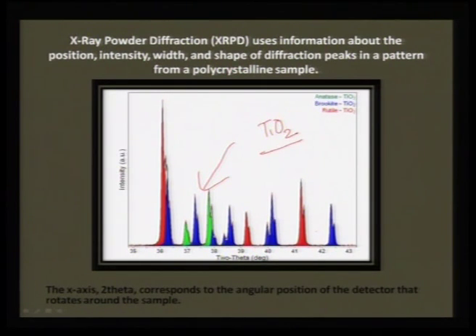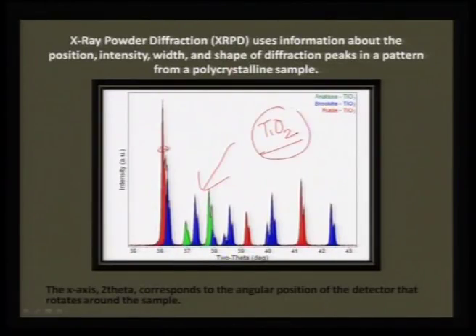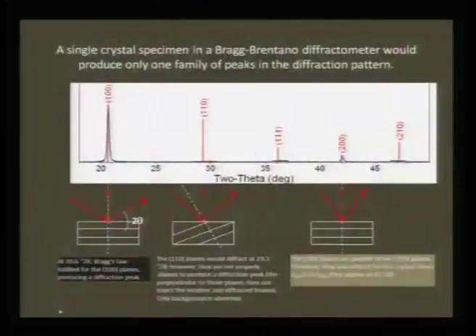What you should be careful about here is that within a short range, all these phases are overlapping. So, if you are not precisely measuring, then you might confuse one phase for the other. So, you need to have some idea about all the phases that are possible, which will help you in identifying what sort of phases are present. For example, even today, the greatest challenge is getting TiO2 to crystallize in a preferred symmetry, for example, rutile. But what happens? Anatase comes as a major impurity phase. So, chemical approaches are used to stabilize only the rutile phase. So, it can become more confusing if we do not know what all the different phases are that can be present in your given sample.